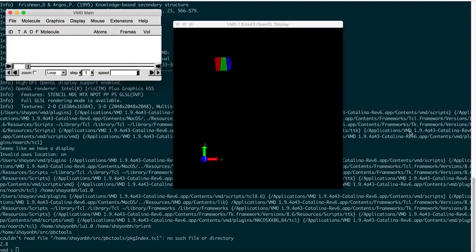In this tutorial, we'll see how to visualize, represent, and manipulate a PDB file using VMD. So we have already downloaded the PDB file 1IL2, that's for the aspartyl tRNA synthetase, and have visualized it in the text format. So we'll feed this file into the VMD software.